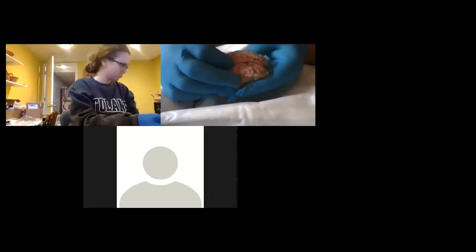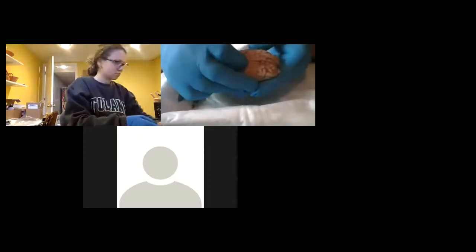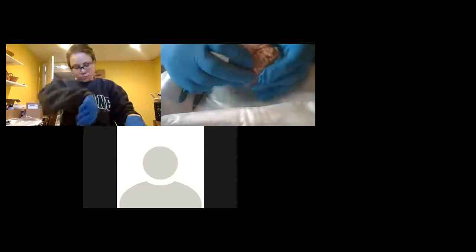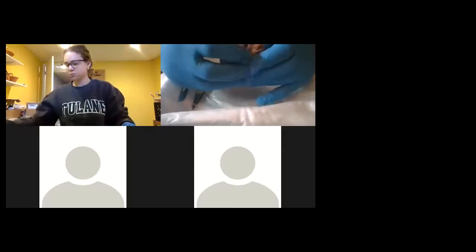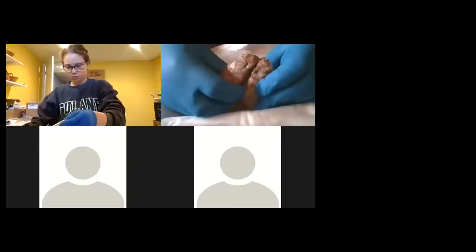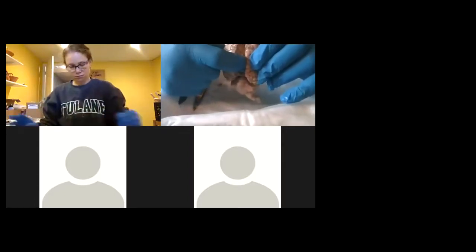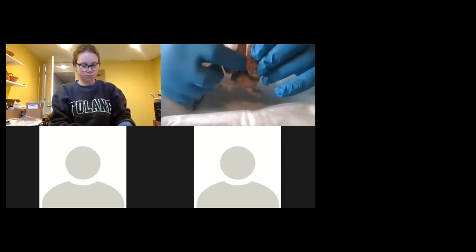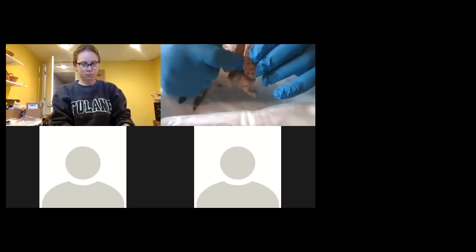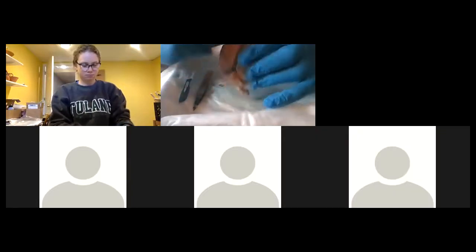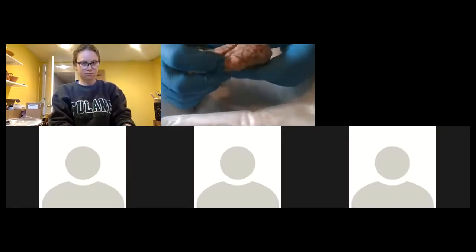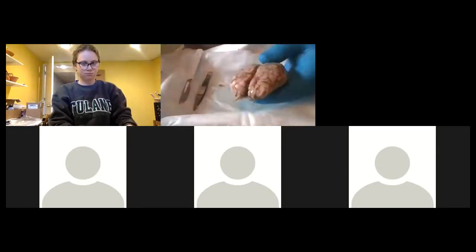So now in the middle, you have the longitudinal fissure, which you don't have to cut anything to separate. You can do that with your fingers. I don't want to destroy the tissue. So you could separate that gently. And you could feel, if you press in here, you could feel the corpus callosum, which is the commissural white matter between the two hemispheres. You could pretty much open it up to the frontal lobe and break apart that pia mater that really holds them together at that point.